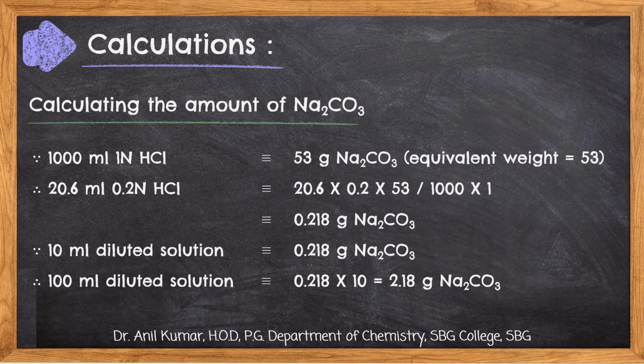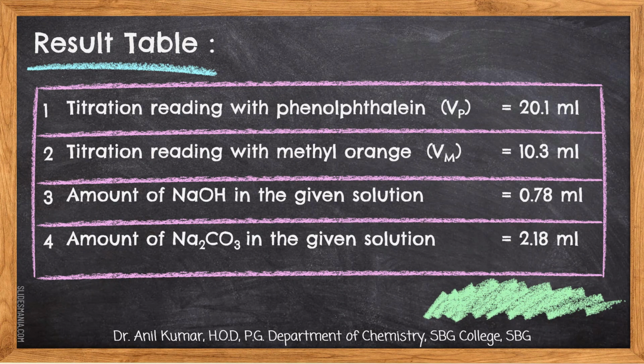Now stop. Now add a drop, five drops. Does the color come? Yes. This, sir, or this one? This is just orange red. Orange changes into red. And see at what point it comes, you just see the value. The reading is nearer.